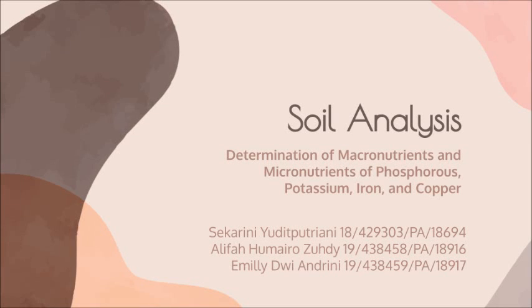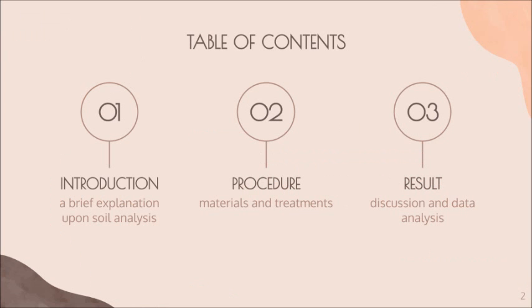Hello, everyone. Today we are going to present to you about soil analysis. In this experiment, we are going to determine the macronutrients as well as the micronutrients of phosphorus, potassium, iron, as well as copper. So in this presentation, there will be three things that we are going to discuss.